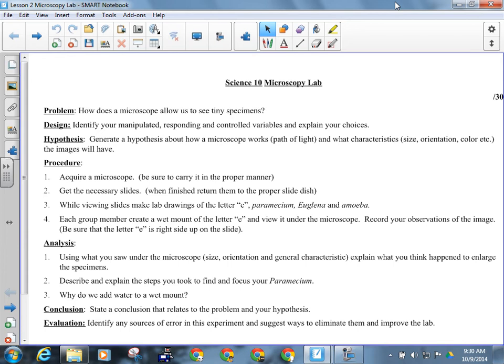We talked a little bit yesterday about how Hooke's microscope worked, and how it was basically that he put a bunch of lenses in a row and it made the image bigger. Does anyone remember how that happened? What did it do to the light? It refracted it or bent it or changed the path of it as it passed through the lenses. And if you put the lenses in the right alignment, then you'll get the path of light resulting in an enlarged image. That's how microscopes work. It's essentially also how telescopes work, anything that magnifies something.